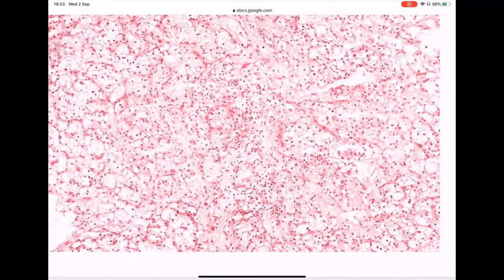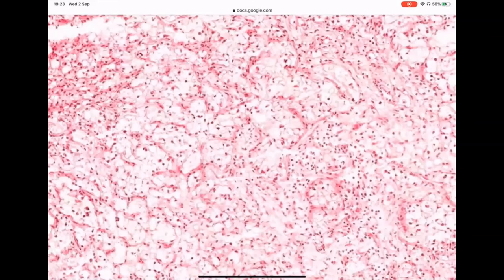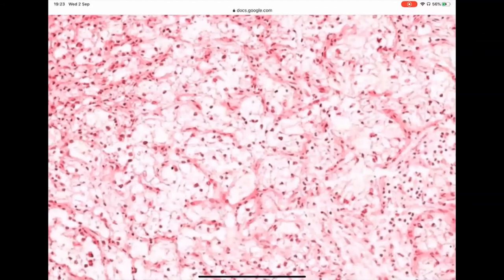Some people have that template that they wrote when they attended some lectures, and then they go and spell it out on the exam. I wouldn't go that far. Now, one thing I would say is that the adrenal gland tends to be more sheets, and they don't tend to be nested or have this rich vascular trabecular pattern around them. The adrenal rest usually sits on the surface, as I told you.